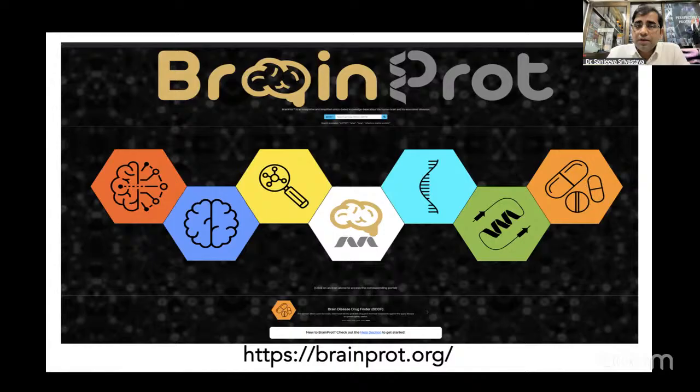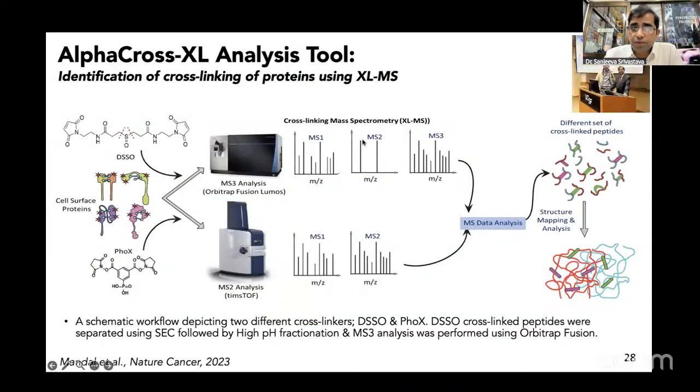The V3 version is running and was recently published in the Journal of Proteome Research. I'd encourage many of you to utilize it and look at the almost 56 brain diseases which we have, search for your proteins of interest, look at their expression profile, look at the classified signals from that, and look at their potential drug targets. All of that can be identified from BrainProt.